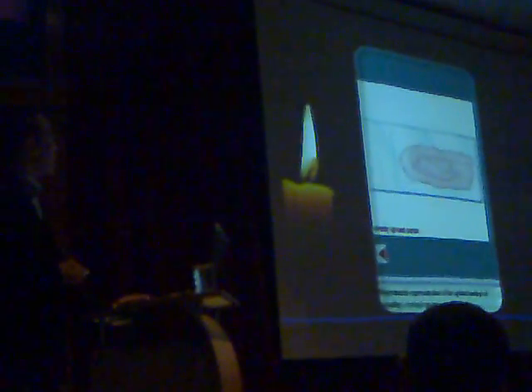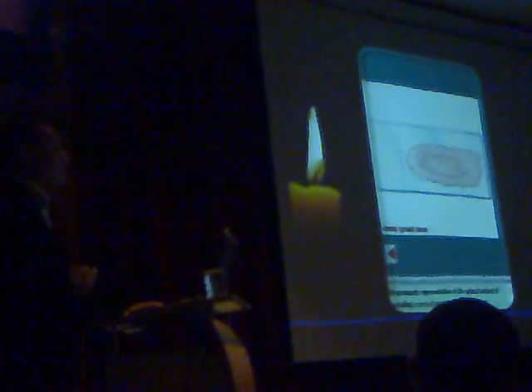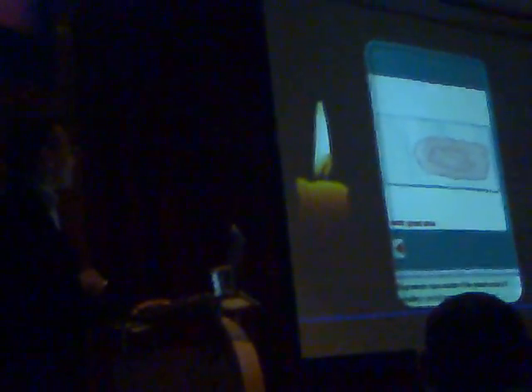The result is a smooth film, satisfactory for staining. If I take this with immediate fixation, the result will be satisfactory. But if the cytologist finds a sample like this, it is an unsatisfactory smear. Why? Because I spread the sample in a rough manner, so it is collected in multiple layers and the fixative doesn't reach it.